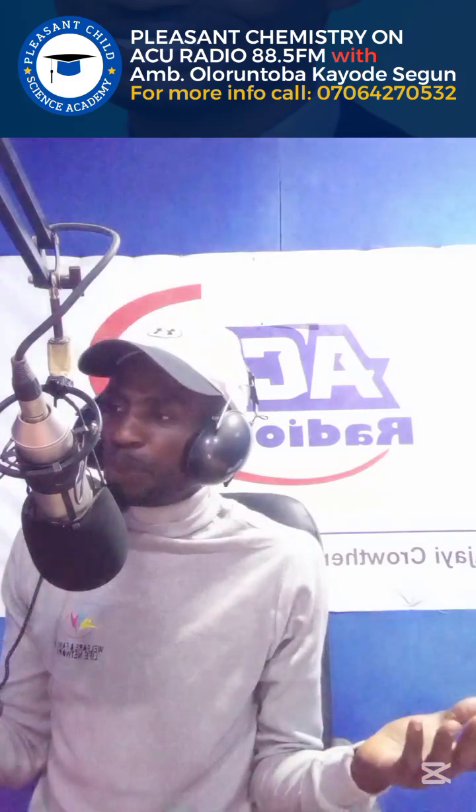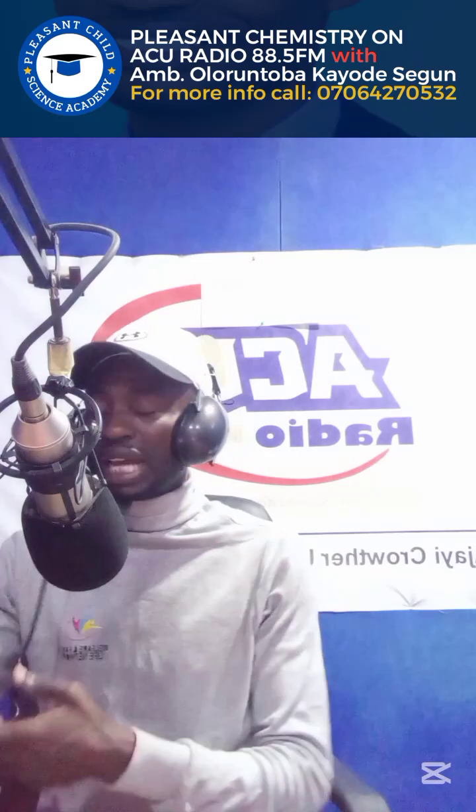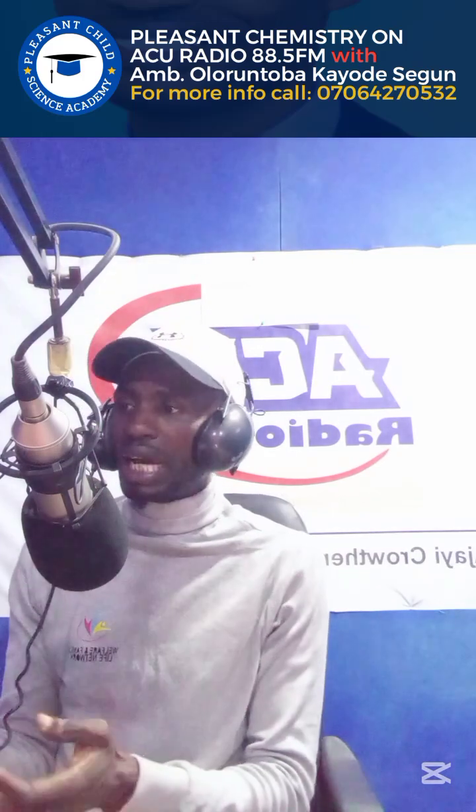And we have what we call the endpoint. What is the endpoint? The endpoint is the volume at which the acid has actually completely neutralized the base.